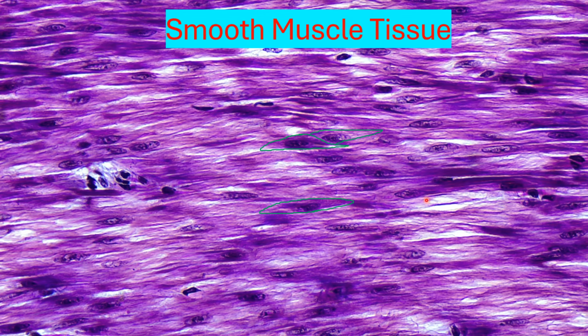And we note that, hey, there's a bit of this spindle-like shape to it, where we have a nucleus in the middle and it tapers out on both sides. And you look around, you see that's pretty consistent all over the place. So we can deduce that this one is smooth muscle tissue.